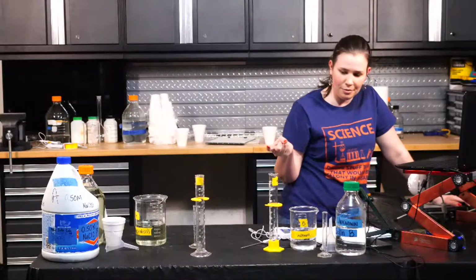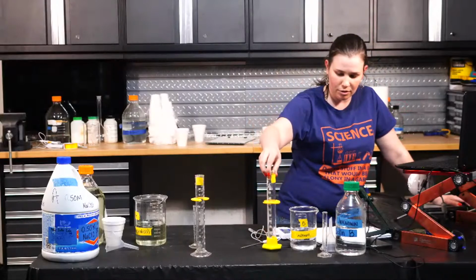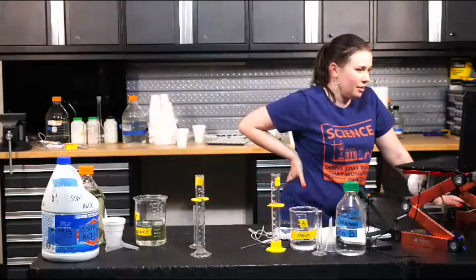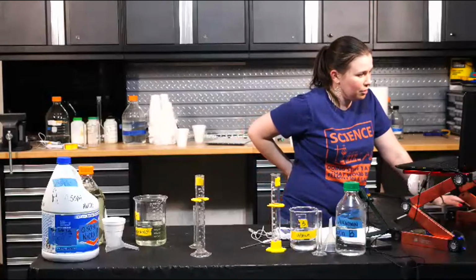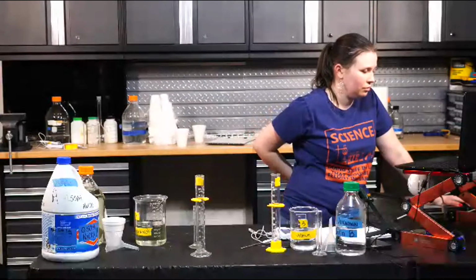So I'm not going to tell you the uncertainty, but I will tell you I used a 100 milliliter graduated cylinder for almost everything, except I used a 5 milliliter graduated cylinder for that. And yes, that affects your uncertainty in your calculations and in your graph. So I am glad that you brought up that it is different, but you are going to have to figure out what they are.